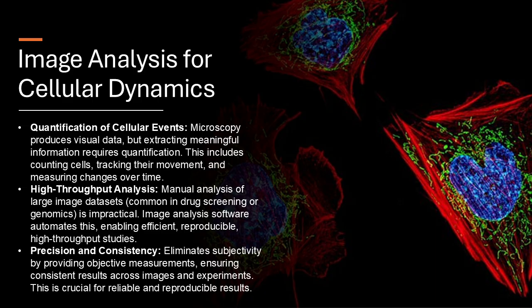It's a process, and it all starts with good images. Okay. Then we have to clean them up a bit. Like getting rid of noise? Yeah, exactly. Then we have segmentation. What's that? It's where we identify the cells in the image. Okay, so we're separating them from the background. Yeah, like sorting jelly beans by color. I like that. Then what?